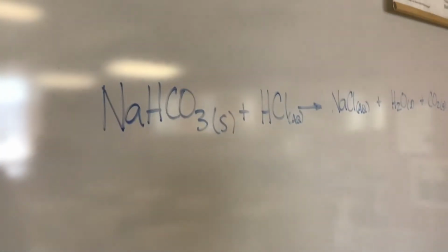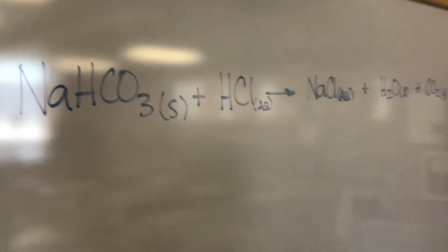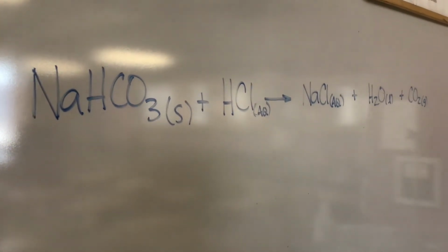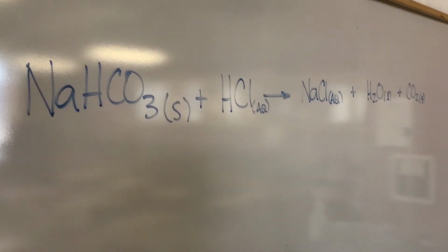Exactly, yeah. So, Mr. Moore has written the balanced equation up here. Well, I guess maybe you should verify it's balanced. It is very tricky to balance. Yeah, this is a tough one. It's very tough to balance.